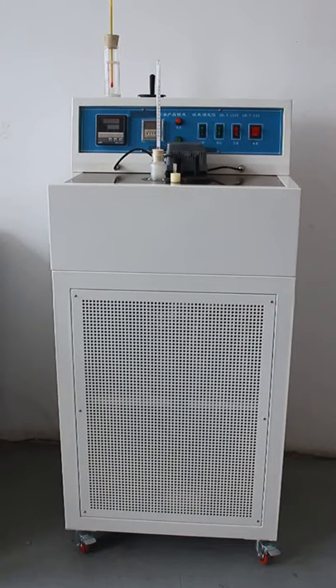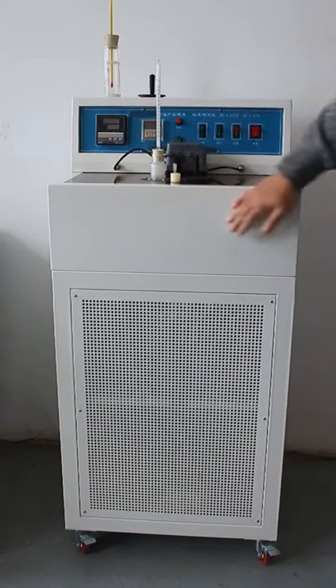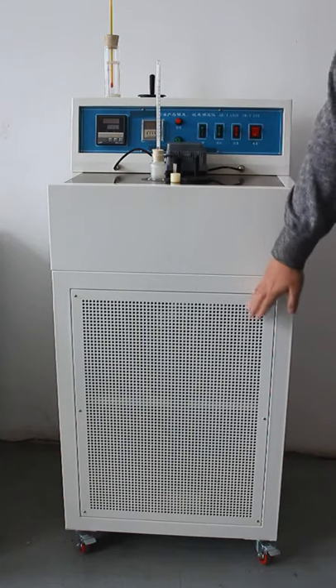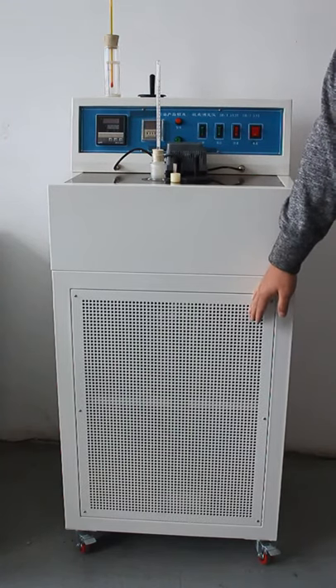Welcome to the Petron Products Pour Point and Solidification Point Tester. This is the main instrument. On the top we have the electronic unit. This is the testing cooling area. Underneath the testing area we have the refrigeration compressors.